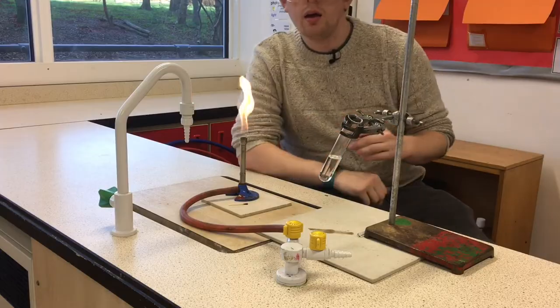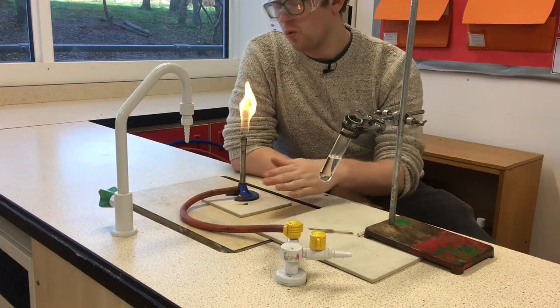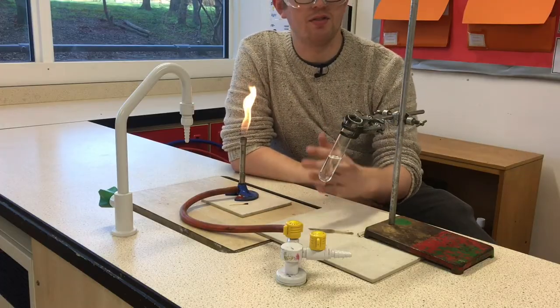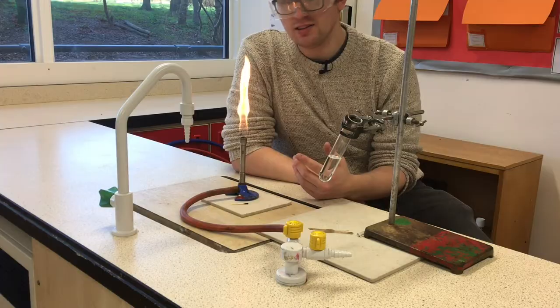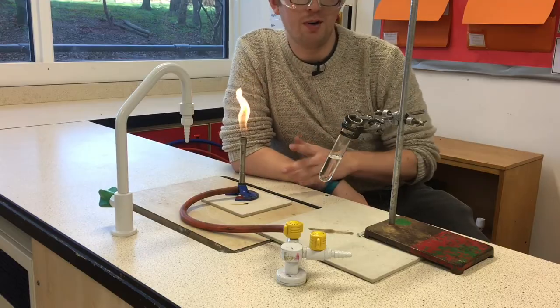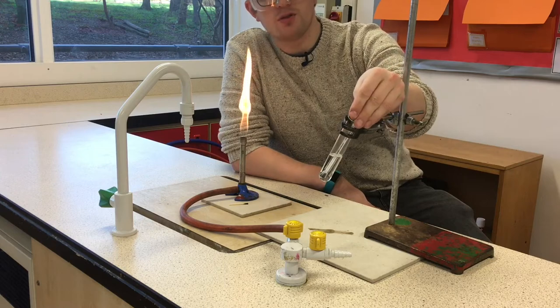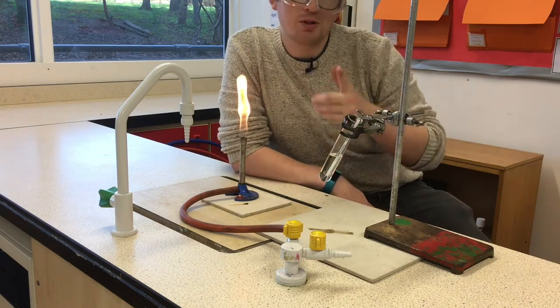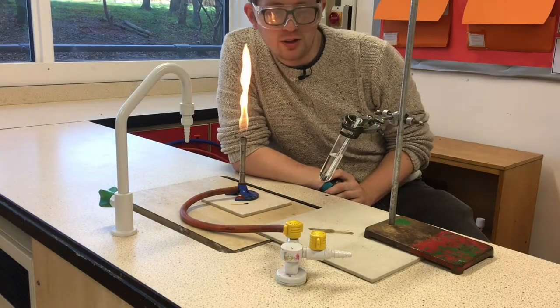Now it's time for our experiment proper. I've got a second heat proof mat — the bunsen burner stays on one and the burning crisps go on the other. Very often when I see people do this experiment they have the bunsen burner right next to it, and I'm thinking, well how much of that heat is going into the water via the bunsen burner and not the food? First thing is to measure the temperature of the water — I'm going to put the thermometer in and leave it there. It's important to write that down, otherwise you won't be able to measure the temperature change — this step is very often forgotten.